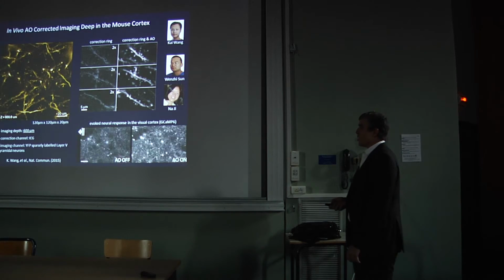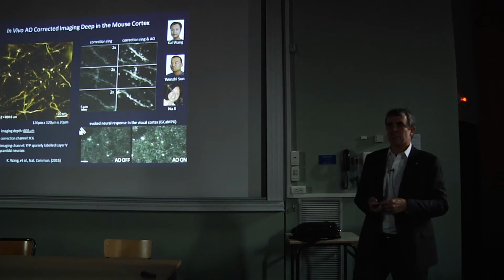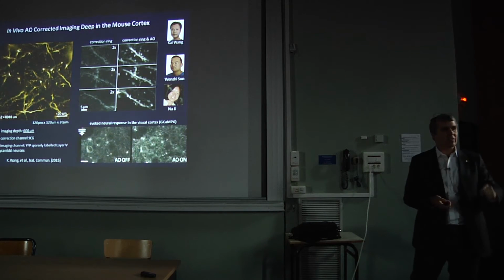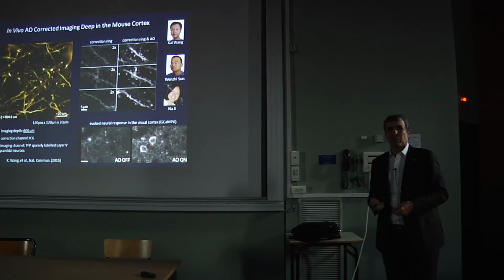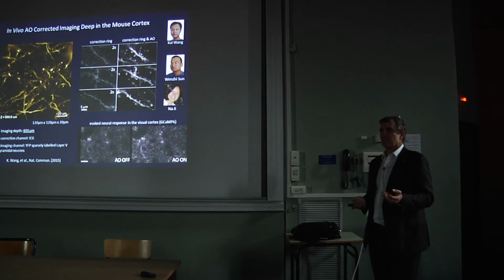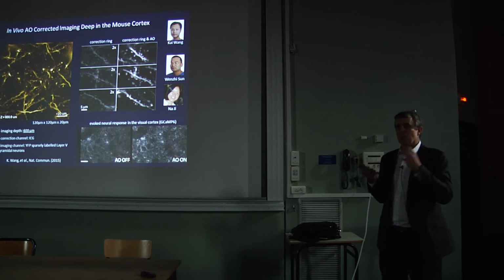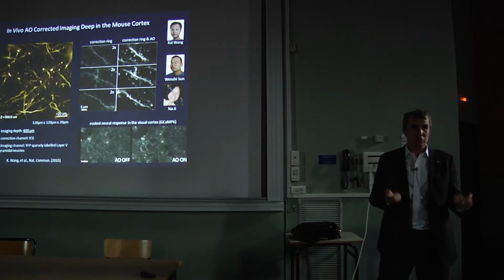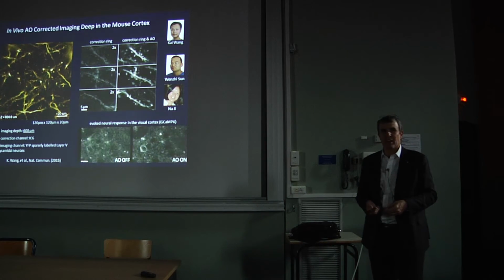All right. Now, one of the limitations of this approach, just the same limitation that you have in astronomy, is you have to be able to see that guide star in order to be able to correct. Now, that's fine because the atmosphere is transparent and a zebrafish is transparent. But one of the main things people study at Janelia is mice and doing neuroscience in mice. And the mice brain, to me as a physicist, when I look at it on a microscope, looks like tofu. And it's really difficult to get any kind of image through that.